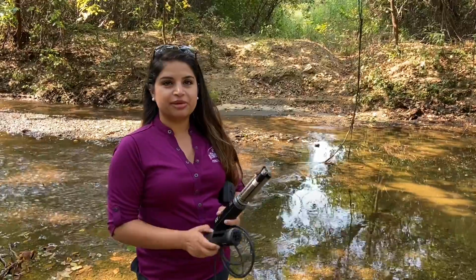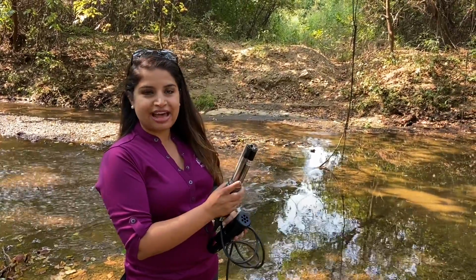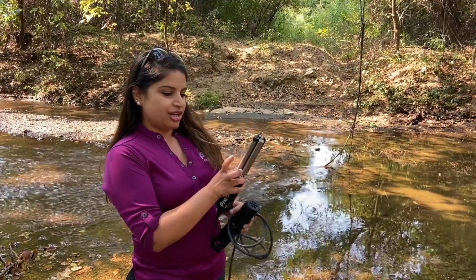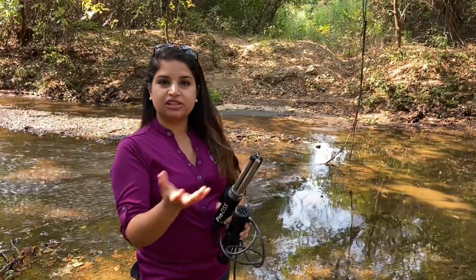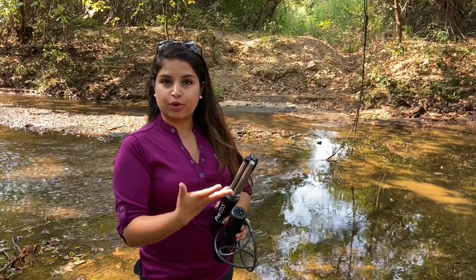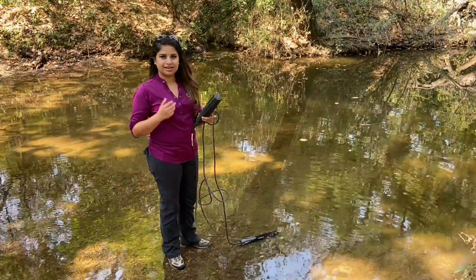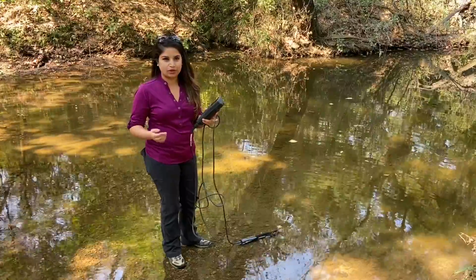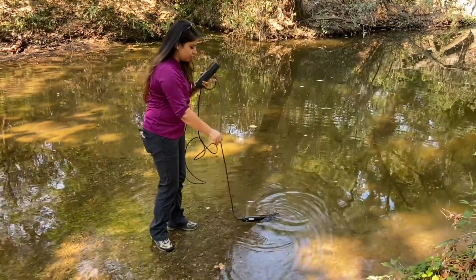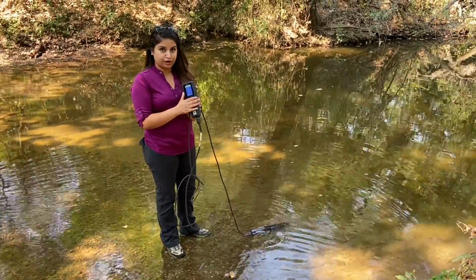To measure our chemical parameters, we use this multimeter, and this multimeter I have here measures conductivity, pH, dissolved oxygen, and turbidity, along with temperature. And we calibrate all these probes in the lab before we go out to the field for a sampling event. So once we're at this sampling location, I make sure my probe is completely submerged in the water, and I wait for the readings to stabilize on my handheld monitor.